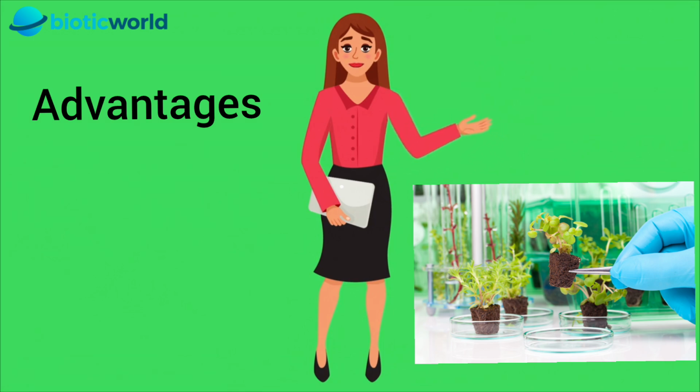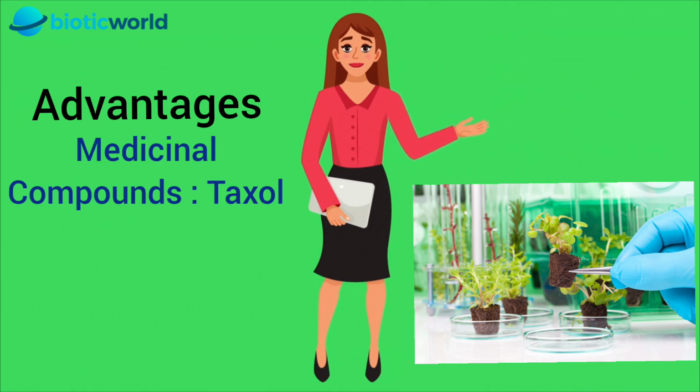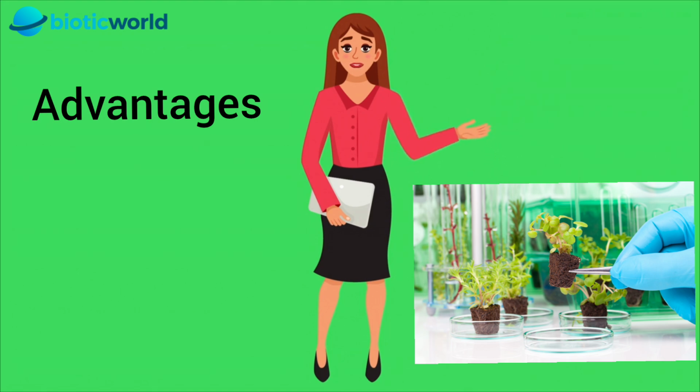Beyond traditional agriculture, plant tissue culture has revolutionized the field of biotechnology, and it's being used for a variety of applications that are reshaping the future. Certain plants are used for the production of medicinal compounds, such as Taxol from the yew tree. Through tissue culture, these plants can be grown in controlled environments to produce secondary metabolites, which are then harvested for pharmaceutical use. This reduces the pressure on wild populations and ensures the sustainability of medicinal plant resources. This is about the pharmaceutical production.